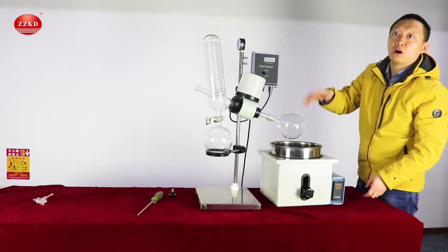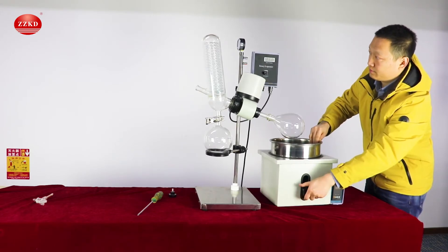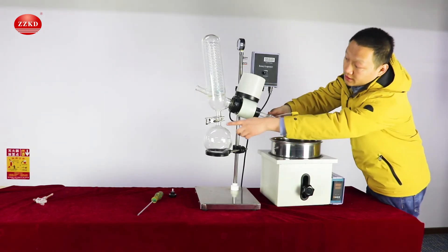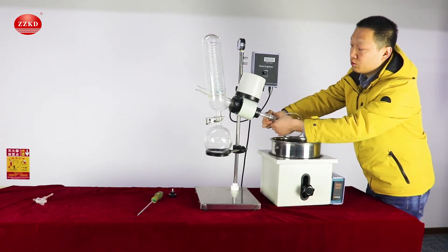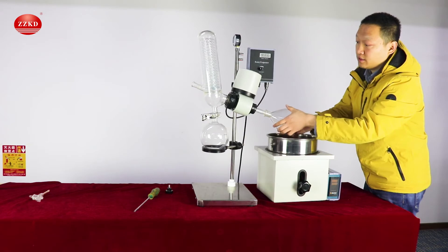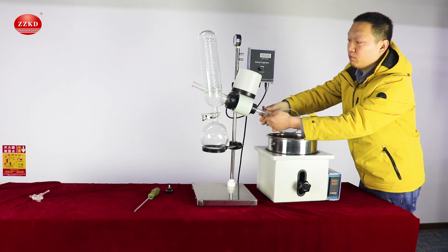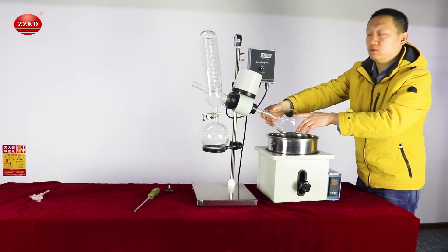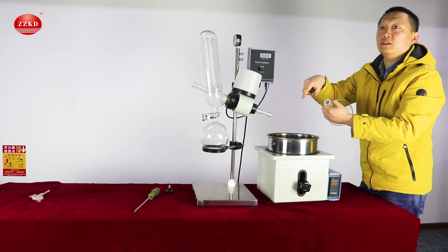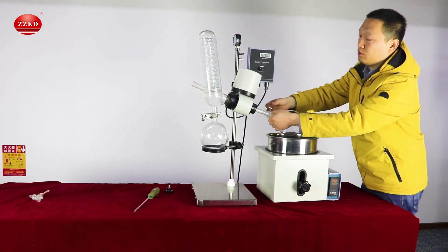This video is just to show you how to put them together. Before you use the system, make sure for this glass mouth part we need to put some vacuum grease and rotate it like this to make sure it is well sealed before you use the vacuum pump. If you don't put the vacuum grease, the vacuum condition might have gas leaking from here, so you cannot create a very good vacuum condition.